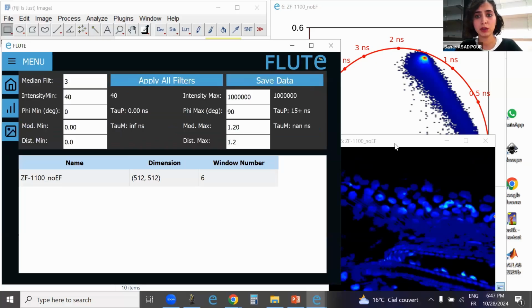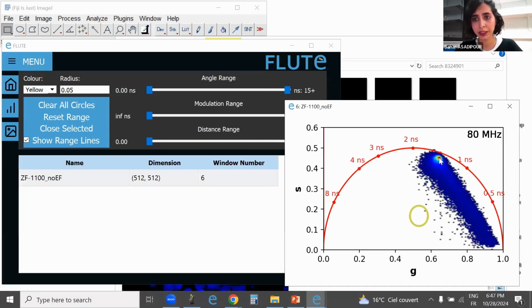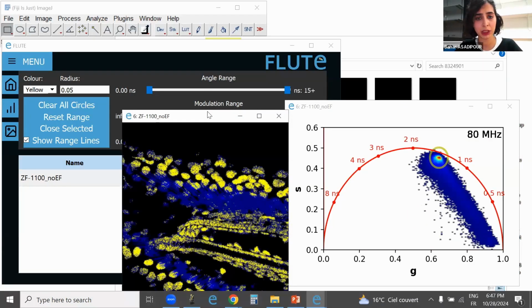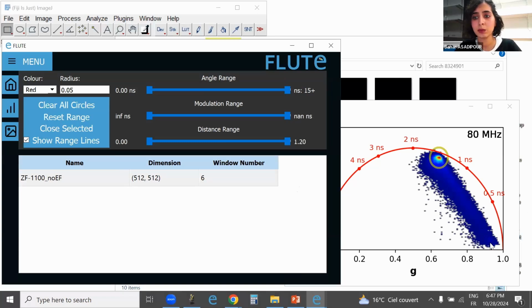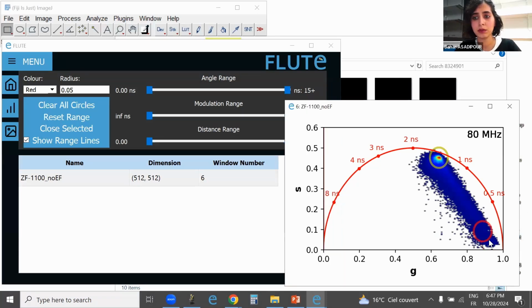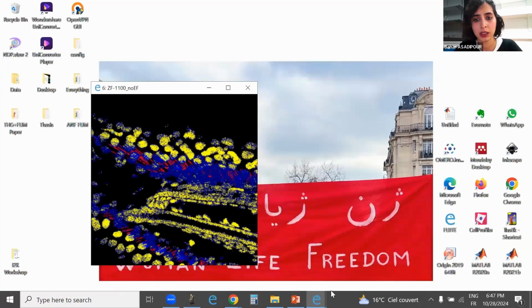And then if I were to show you what it looks like in terms of clusters, we have mCherry over here, and everything that is mCherry is going to pop yellow, and whatever is collagen is going to pop red over here. This is in the tail of the zebrafish. So in the fins, we have a lot of collagen structure, and when you image, you can collect the SHG coming from the collagen. So this is without any filters.